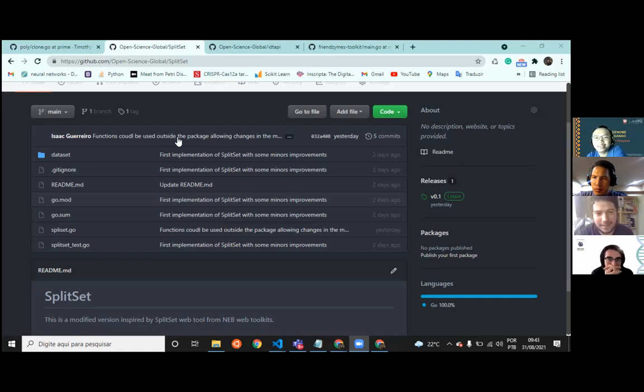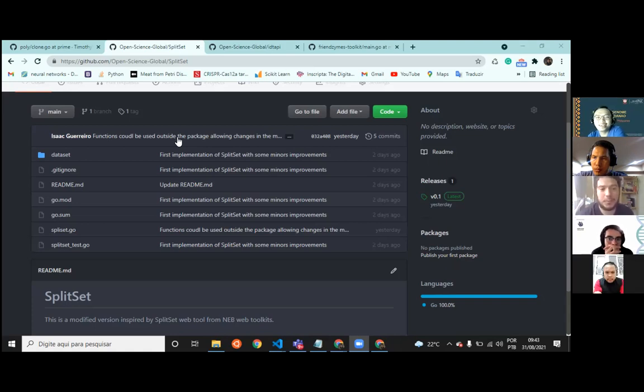Yeah, exactly that. What we could do together. So far, the way I understand it, the software part is quite solid. What I cannot imagine yet is, when you have those designs, how do you integrate that in the wet lab experiment? For example, if I have a plasmid design with, let's say, multiple primers in a specific order, because maybe I would want to generate an amplicon or a panel of multiple primers, how do I apply that specific design to the plasmids that I'm growing in the lab? That's something I cannot visualize right now.